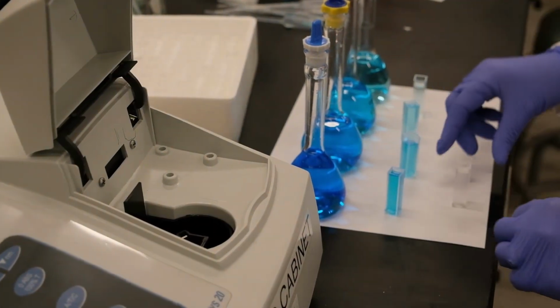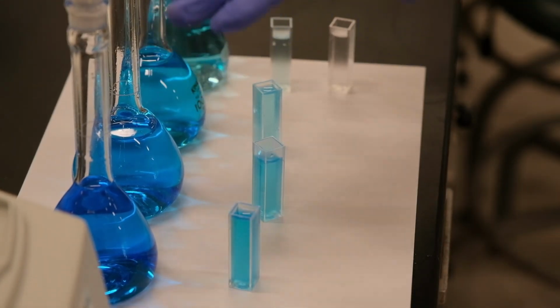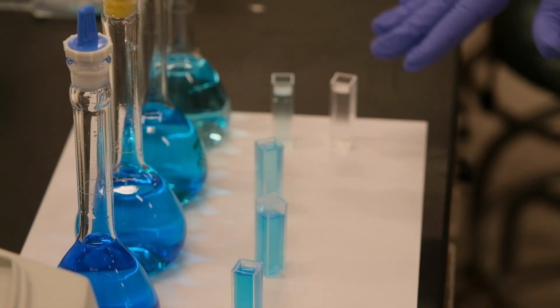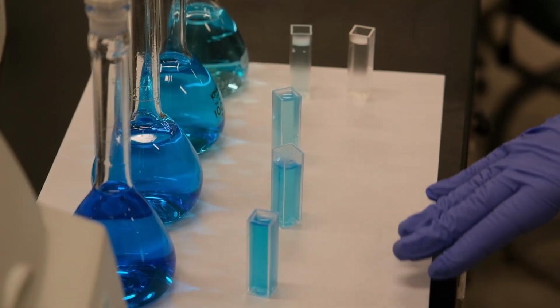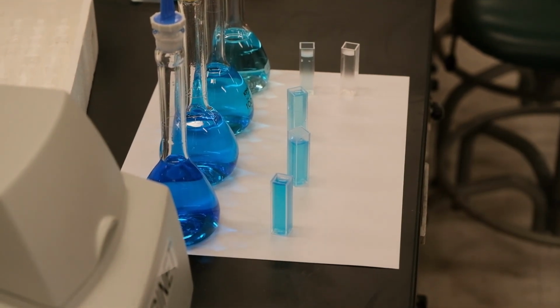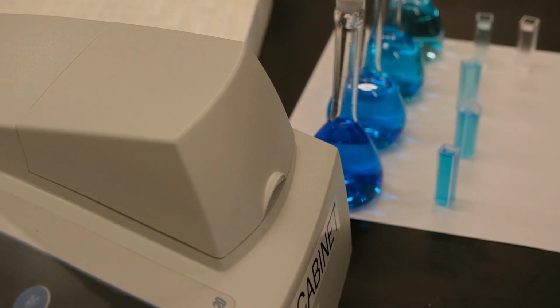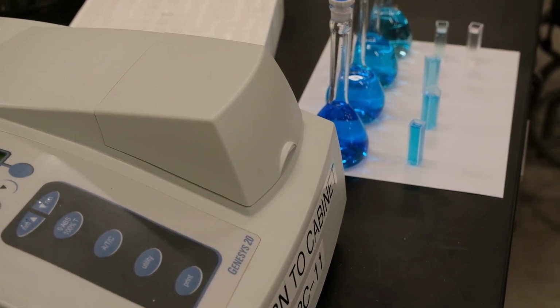Remember that you have to do in lab the calculation to figure out what is the concentration of this fourth solution, and then build your calibration curve of absorbance versus concentration. Now we are going to perform the separation of the mixture of Kool-Aid.